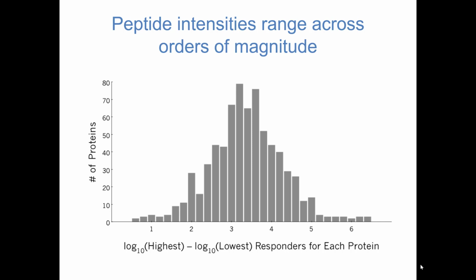Okay, so choosing which peptides you're going to go after is really important for making this decision. Going after peptides that you're not likely to see really gives you a lot of trouble. You end up in situations where you extract out a peptide, and we're really confident that the protein was present in that sample, but that peptide wasn't necessarily present, or wasn't as strong a flyer as we would want to be able to make a call using Skyline.